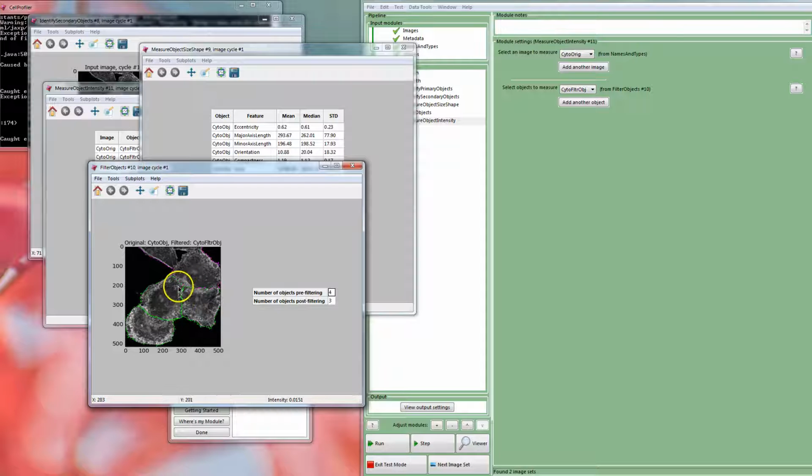We can open it up in Fiji and look at the maximum values and the bit ranges and things like that, just to make sure it makes sense. At the end, whatever numbers you get out of the Excel sheet, you can just multiply that column by 255 or by 4095. Post in the comments if you have questions on how to pick that out and how to verify.